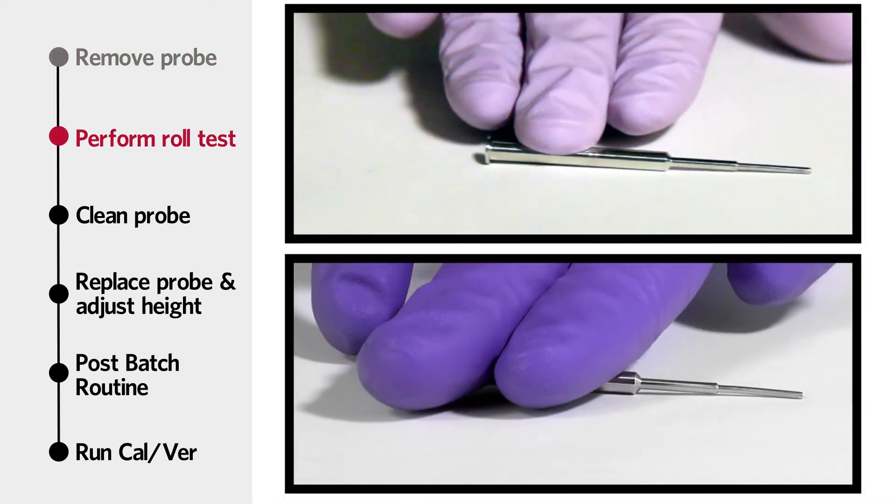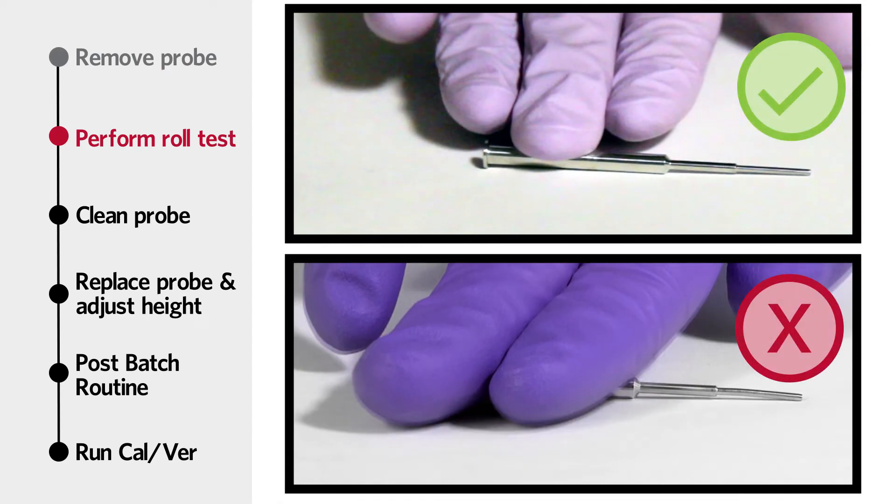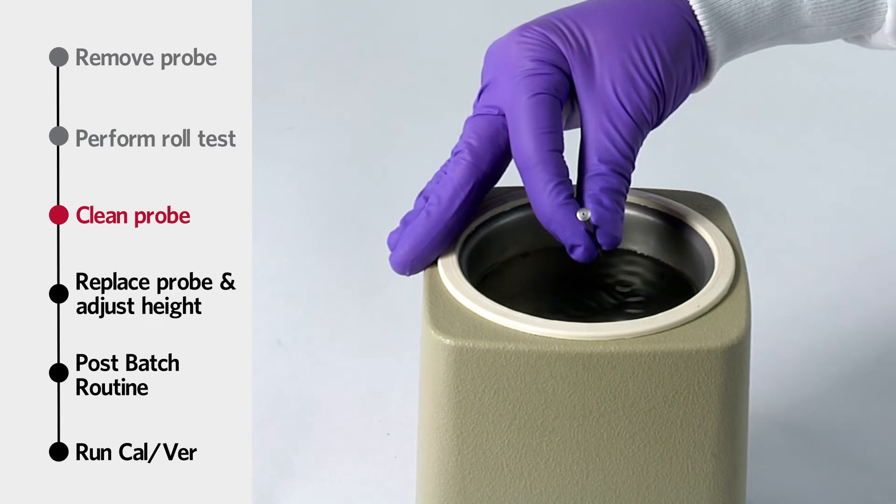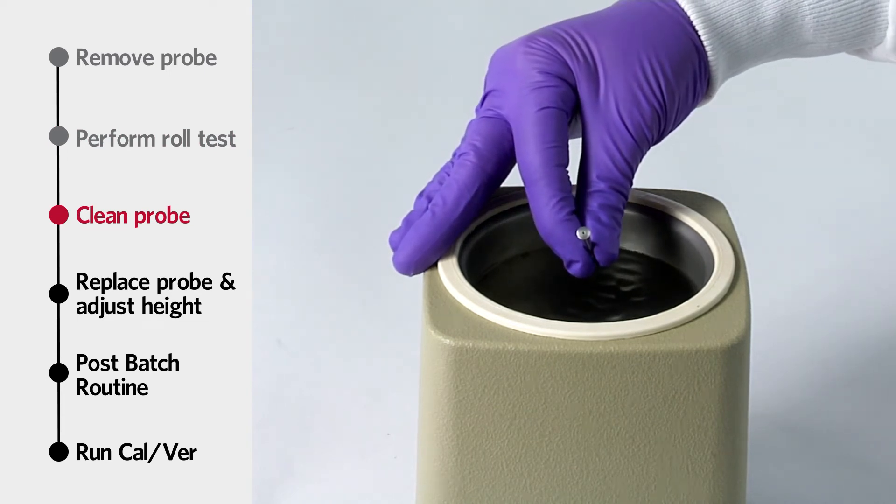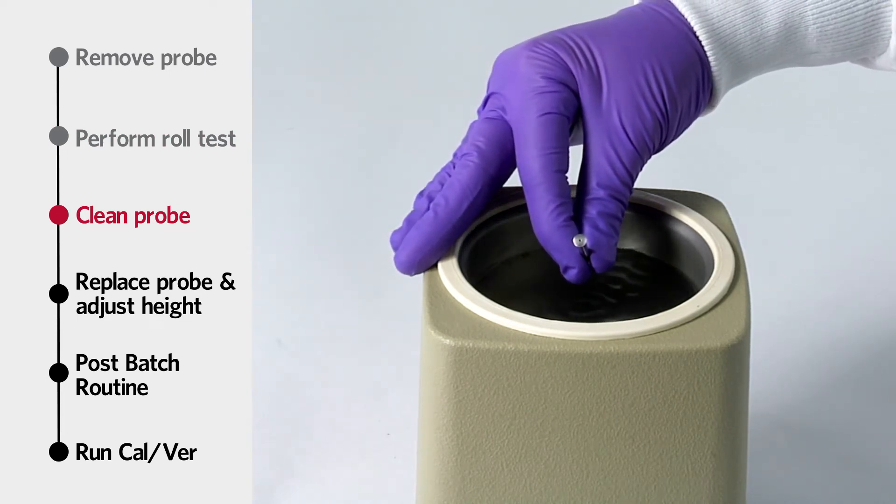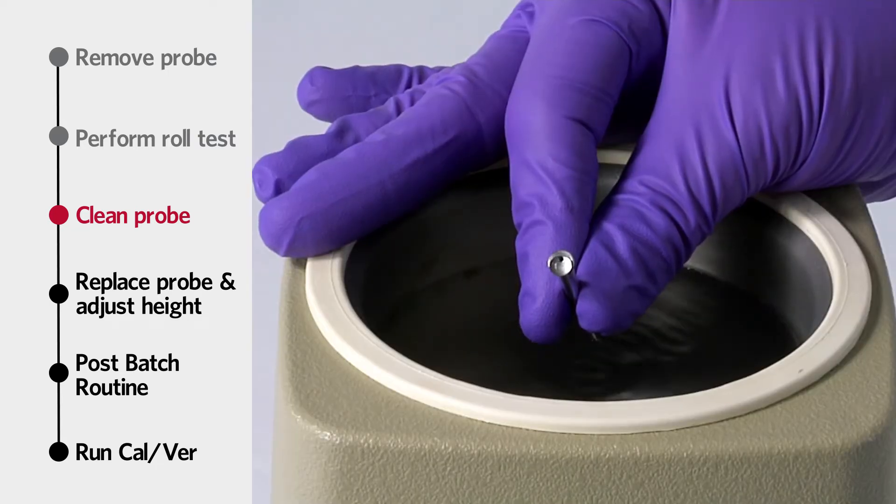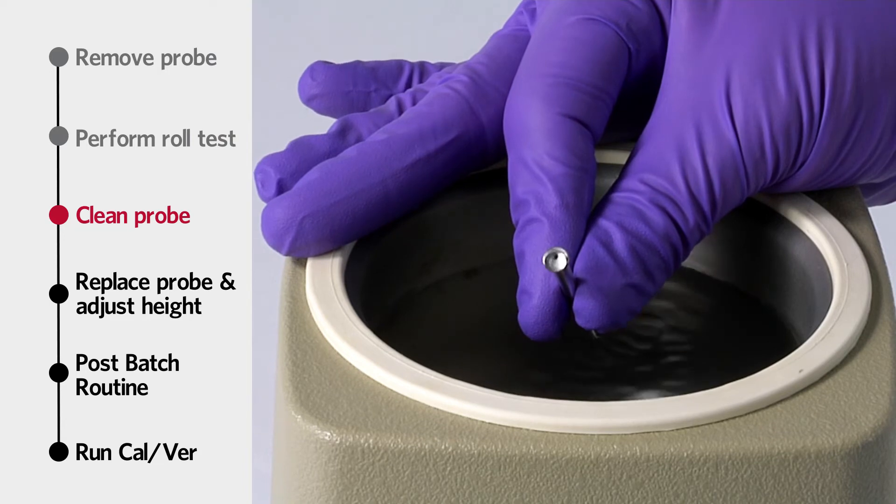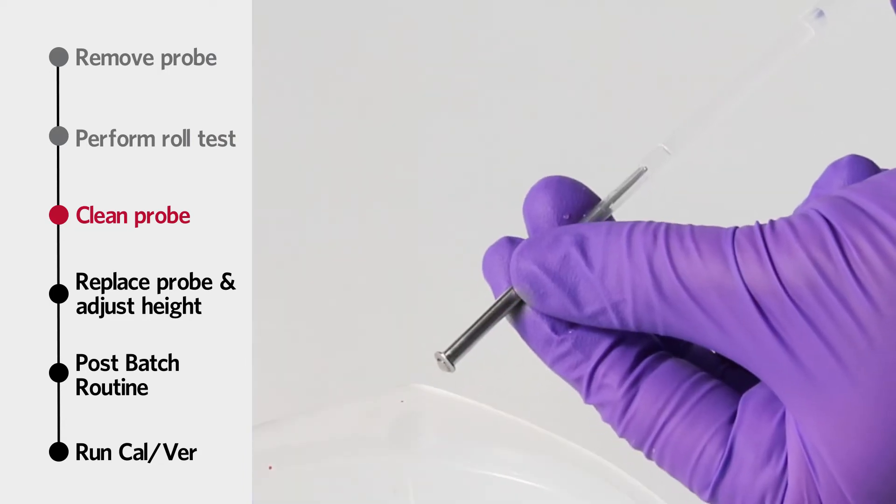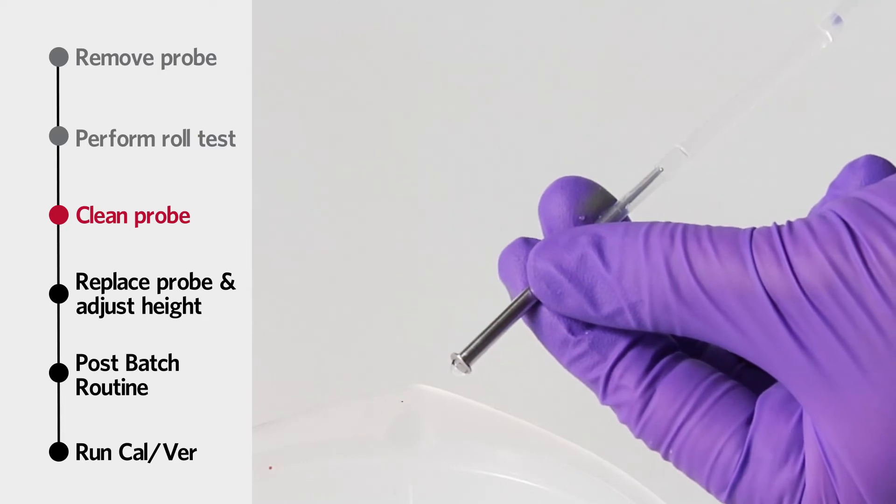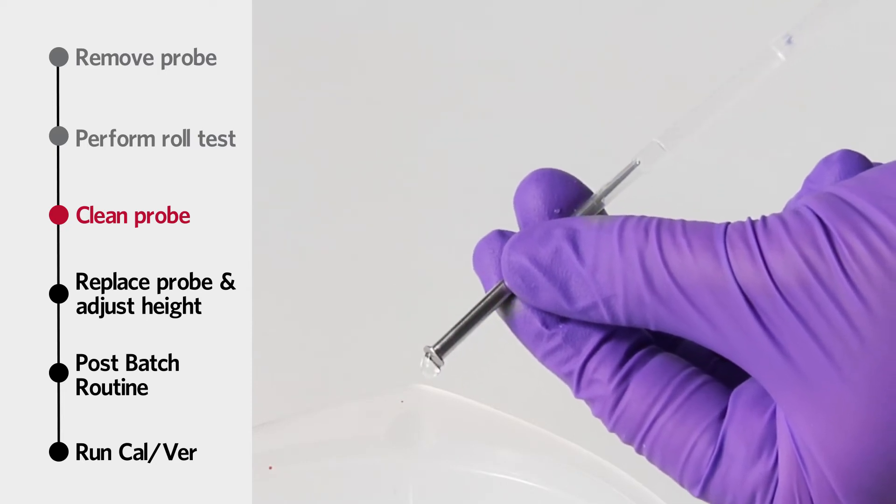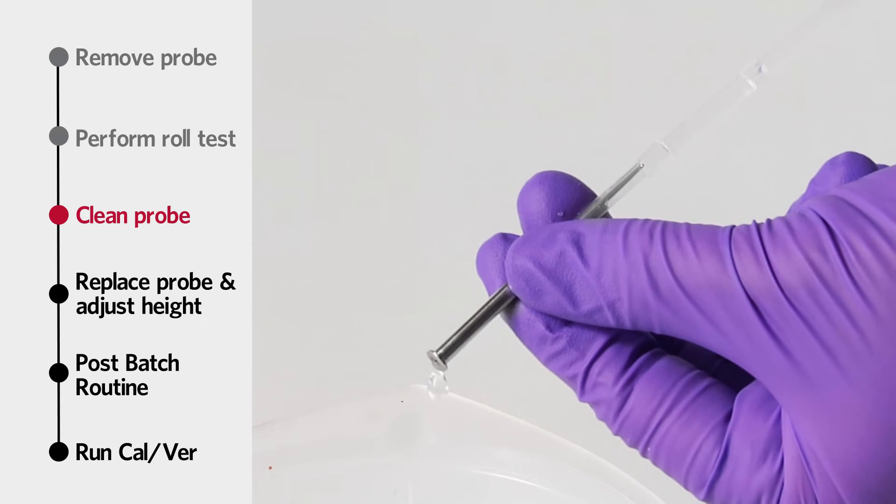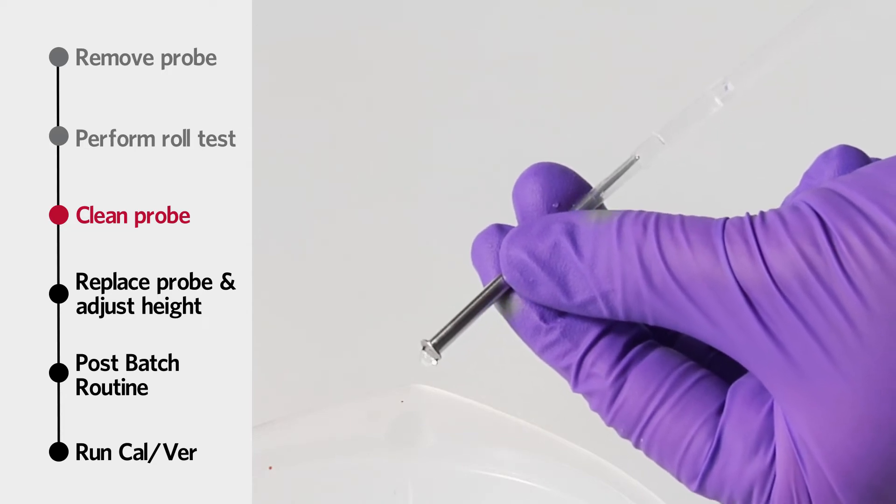Perform a roll test to ensure the sample probe is not bent. Clean the sample probe using either a bath sonicator or a 10 microliter syringe, or both. If using a bath sonicator, place the tip of the sample probe in the bath sonicator for 2 to 5 minutes. If using a syringe, force distilled water through the tip of the sample probe to its large end. This dislodges any debris clogging the tip.